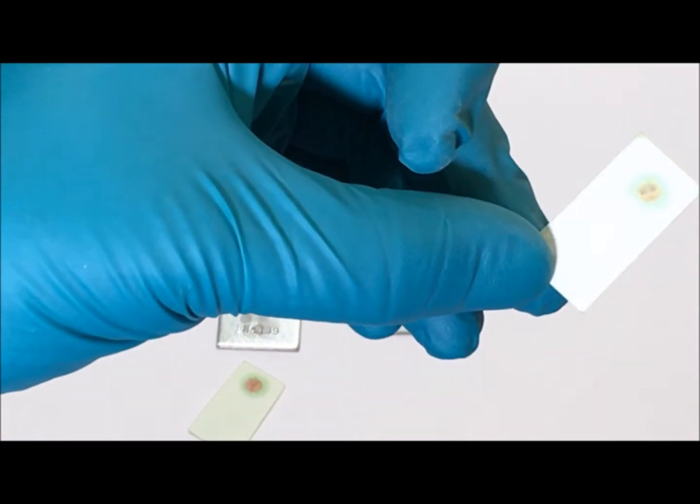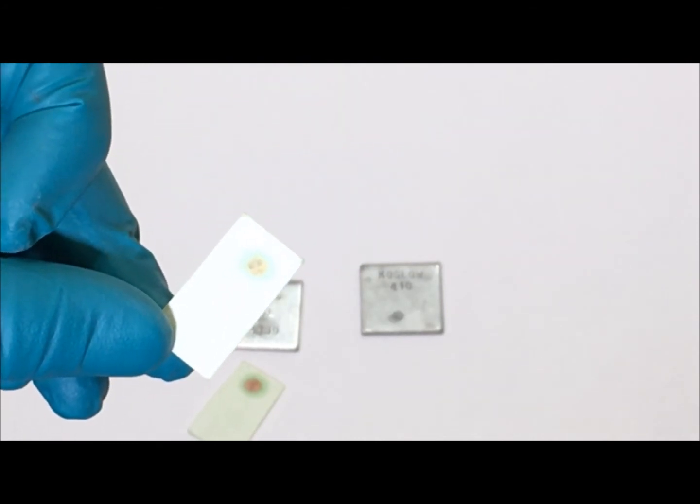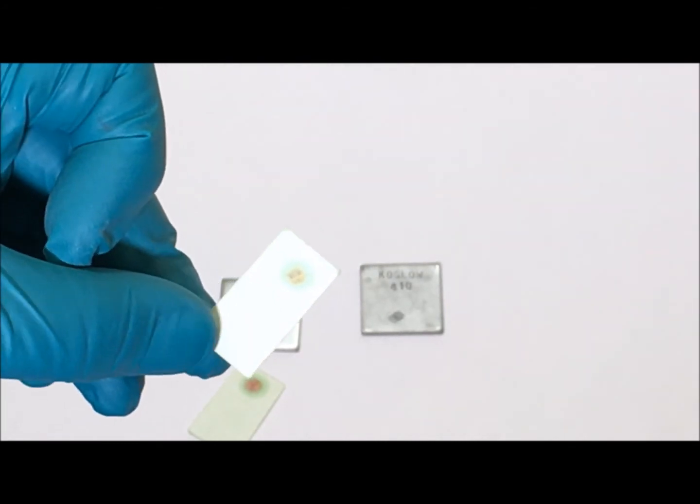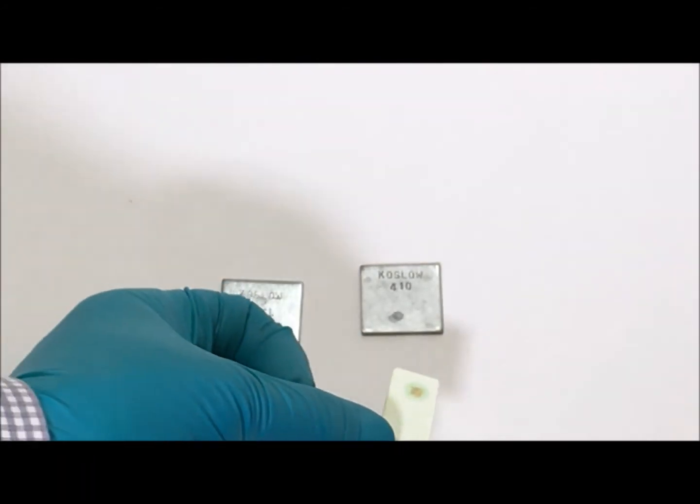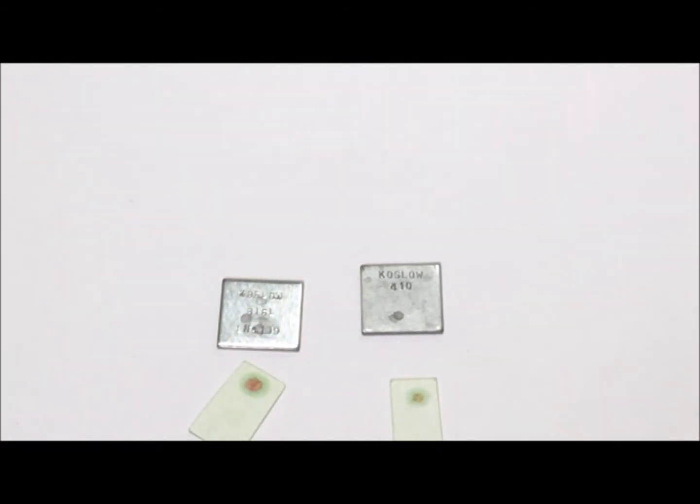So in this case the negative result is the 400 series, and the 300 series, because it contains nickel, gives you a positive test.